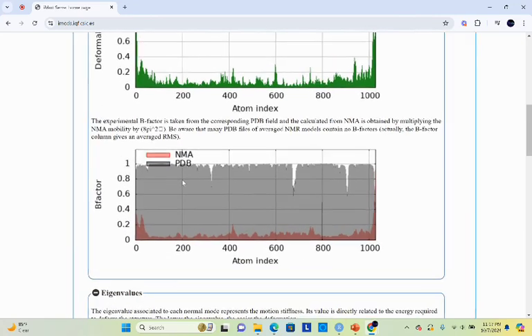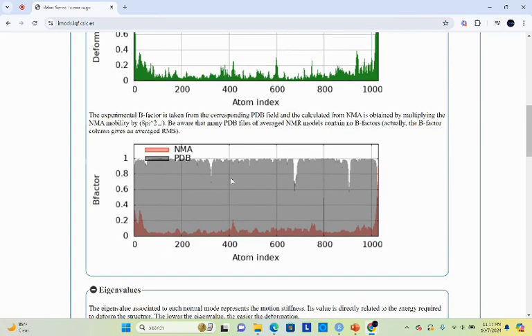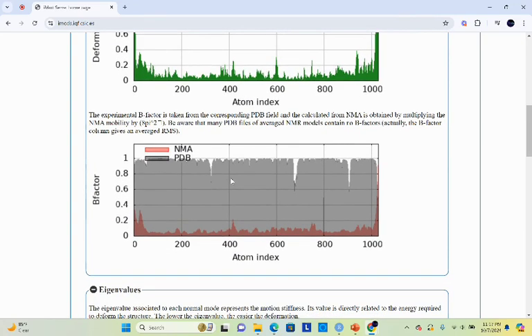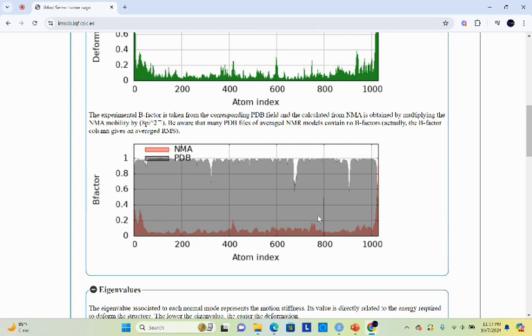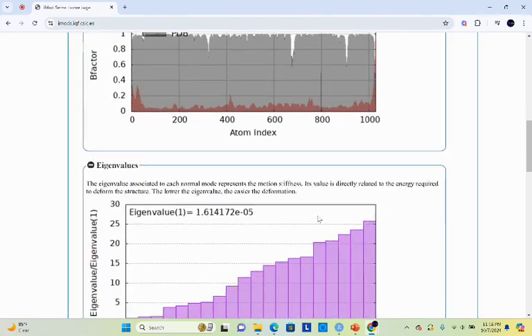Next you can see the B factor comparison. B factor compares your structure with the PDB structure. Here you can see that the alignment is different, which means that your NMA structure is not similar to the PDB structure.